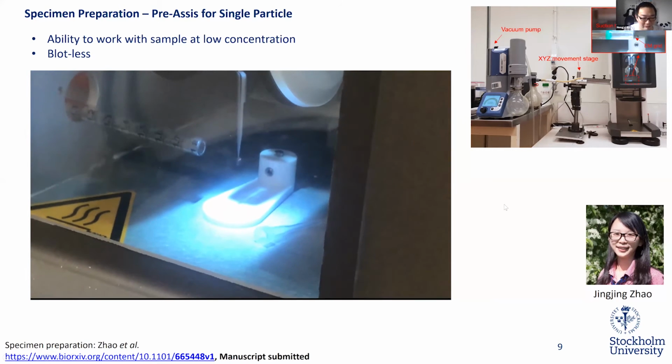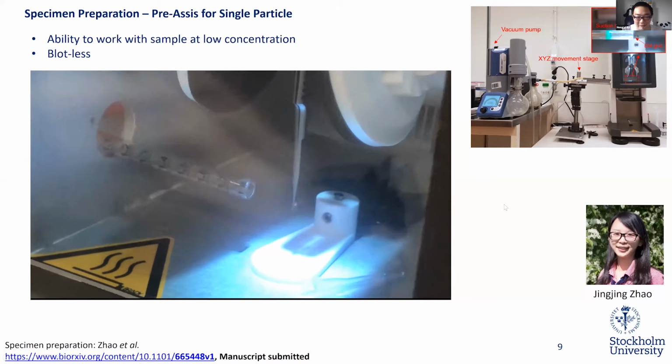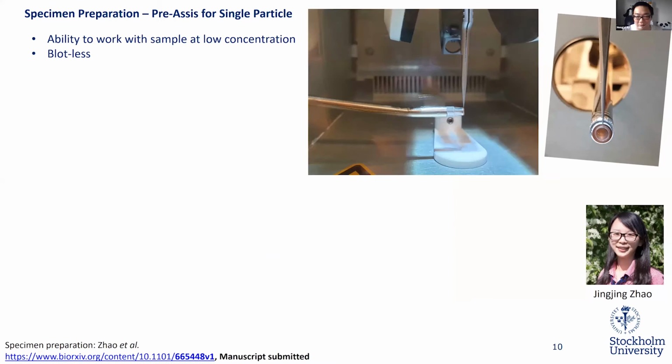And this has actually received quite a lot of attention, and I think a lot of constructive criticism as well. So we've been working very hard on improving this method, and we still believe that it works quite well. So this is the latest iteration of this method. We now have a much better tube. It has been modified, and now the position of the tube can be reproducible every time.